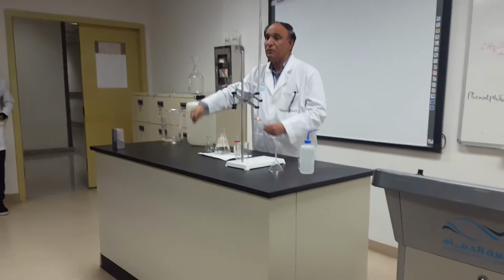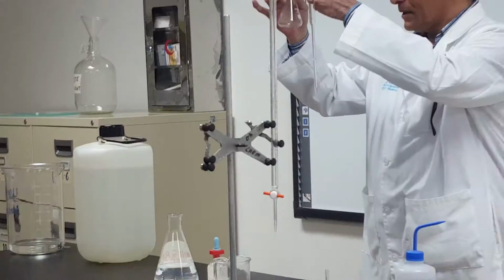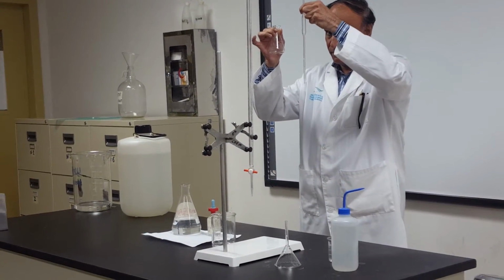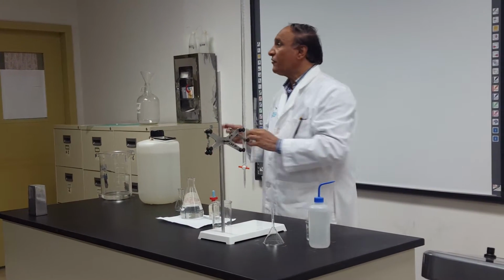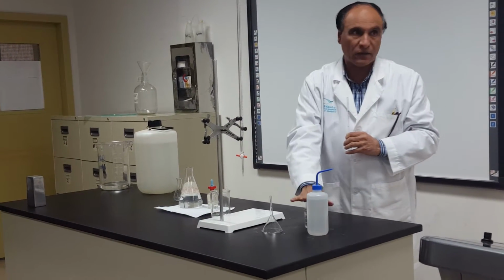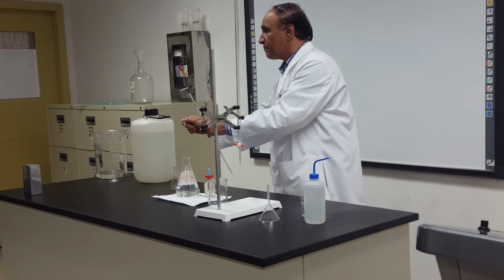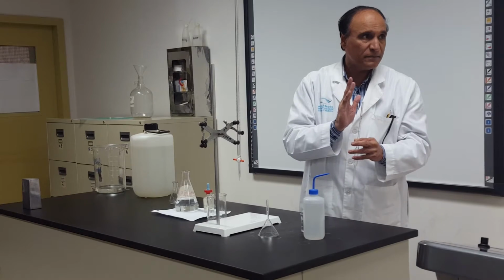The student who is taking the acid will take 2 things with him. 2 things. Not one. He will take 2 things. And the other student will not wait for him. He will fill the burette with the sodium hydroxide. One student will do his job. Meanwhile, the other student will do his job. Did you understand? Yes. Okay.